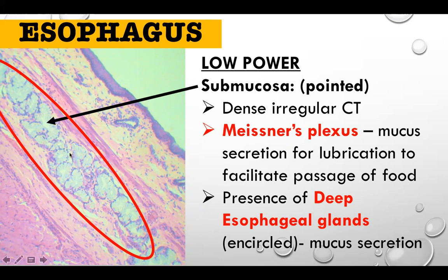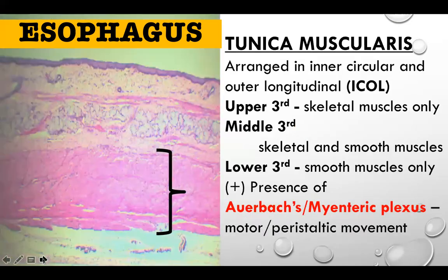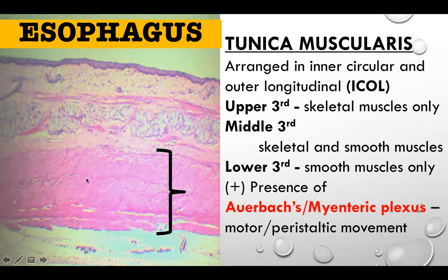The third layer is the tunica muscularis, indicated by this bracket. They are arranged in inner circular and outer longitudinal — ICOL. A common exam question is to identify the lining epithelium as stratified squamous, and recognize the deep esophageal glands, confirming this is the esophagus.